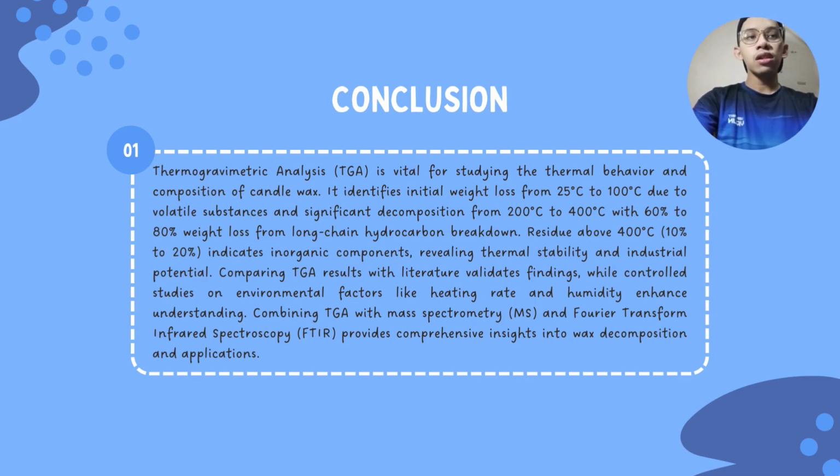Comparing TGA results with literature validates findings, while further study on environmental factors like heating rate and humidity enhances understanding. Combining TGA with mass spectrometry (MS) and Fourier transform infrared spectroscopy (FTIR) provides comprehensive insight into wax decomposition and application.